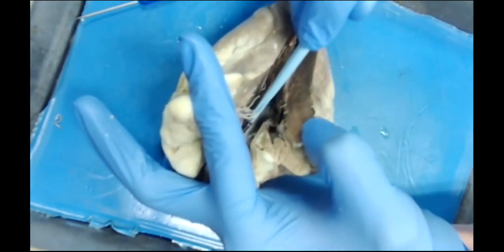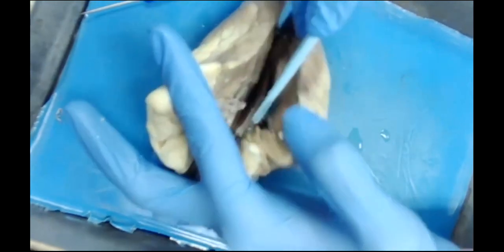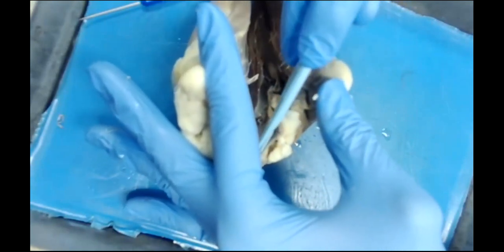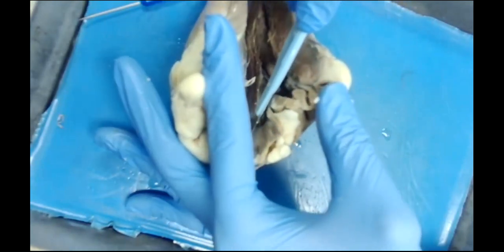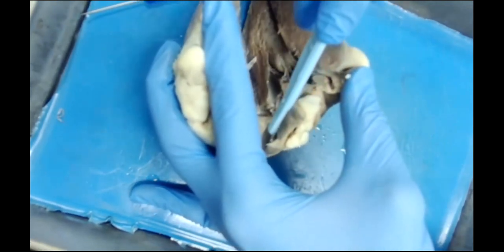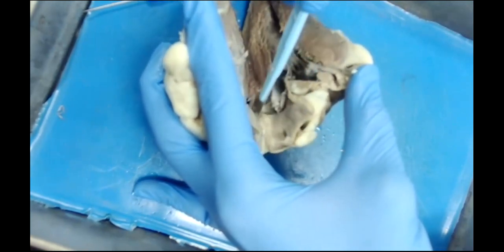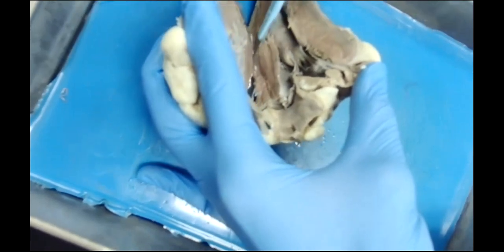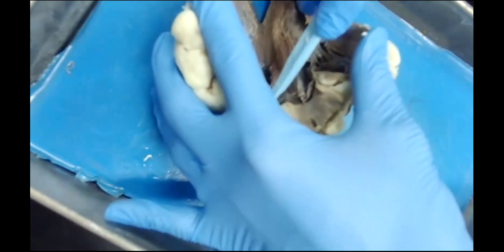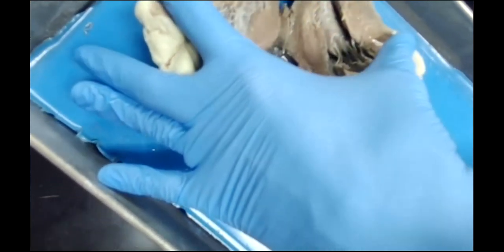Now, whenever you're doing a dissection, you want to use single long strokes. You'll notice that I'm not stopping to saw. I'm trying to let the blade do all of the work, and my hand's just here to help pry it apart so that I can get access to more tissue to cut. And no, that is not heart juice. That is some preservative. So don't worry too much about that.